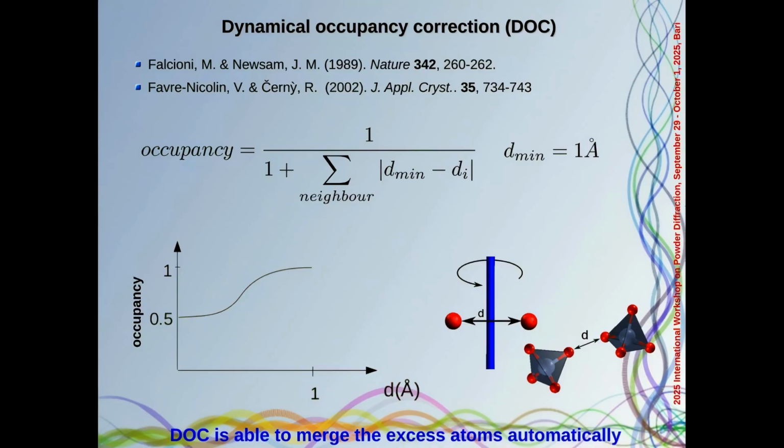So the consequence of the application of this algorithm is that you have to calculate the symmetry equivalent atoms in the unit cell, and at the same time calculate the distance between pairs of atoms. In general, this algorithm in the software is optimized, but it can slow down the computation and the application of a real space map.